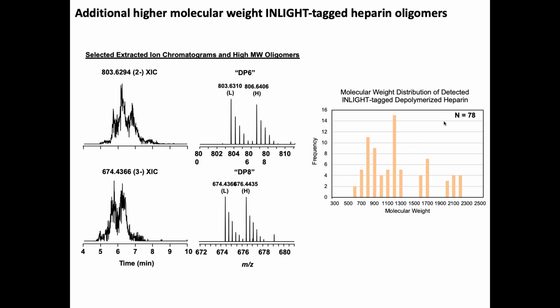You can think about chemical derivatization. You can think about capping. If you've got something capped with oxalic acid, you can think about trying to cap the other guys with some other chemical group, so that when you rerun that same sample through the mass spec, those more stable units that you put on there could give you some structural information.